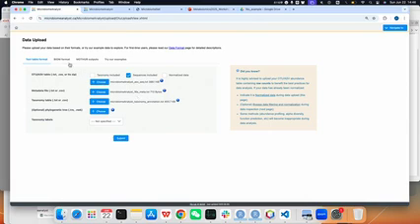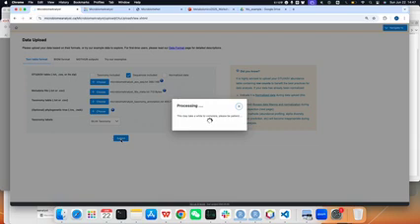No matter what kind of format you use, maybe biome or mothur, if you know about that, the core information is always the abundance, the metadata, and then the taxonomy. Here we don't have a phylogenetic tree, so we just skip this step, and then we need to select the taxonomy label. Just now we used the Silva database, so we just select it, then submit.